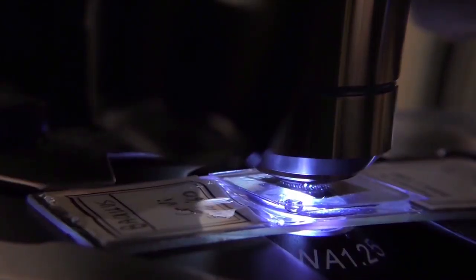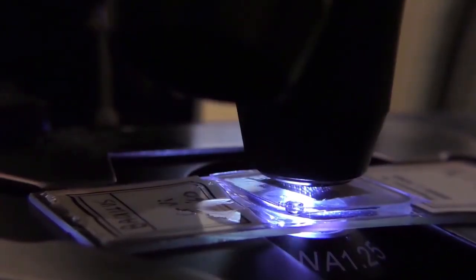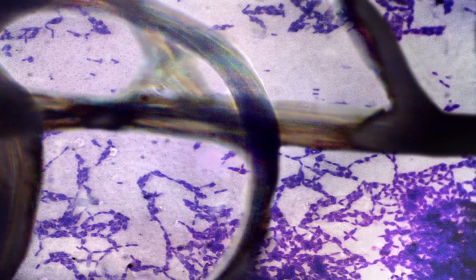Now we magnify over a thousand times and here we can clearly see a few stray fibers from the mask and behind them the bacilli. Clearly they are unlikely all to be intercepted by a fabric face mask.